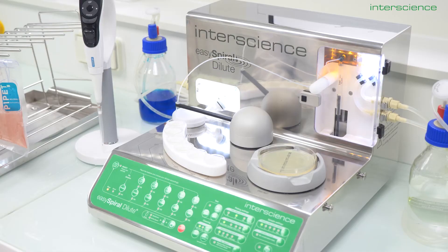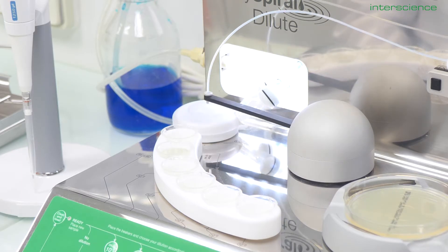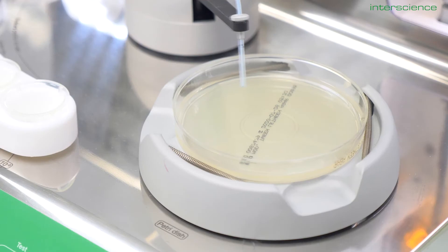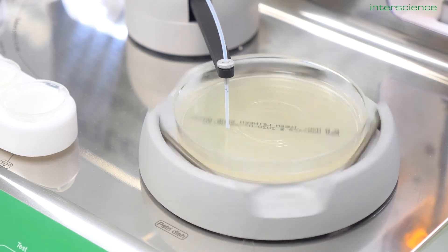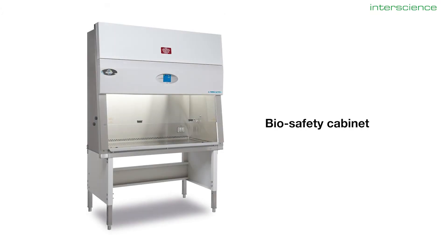With the dilute model of the Easy Spiral range, she can actually do the serial dilutions ahead of time — up to 5 dilutions, though today she will only do 10 to the minus 2. Once she has completed the dilutions, she can pick the spiral plating mode out of 4 deposition modes available on this machine. The spiral method will allow her to have 4 logs of dilution on one plate, so plating the 10 to the minus 2 dilution gives her 10 to the minus 2, 3, 4, and 5 on her plate, guaranteeing a countable range. The Easy Spiral Dilute is designed to fit in a biosafety cabinet for sterile processing, is compatible with all petri dish formats — 55, 90, or 150 mm — and the spiral method is compliant with ISO and FDA BAM regulations.